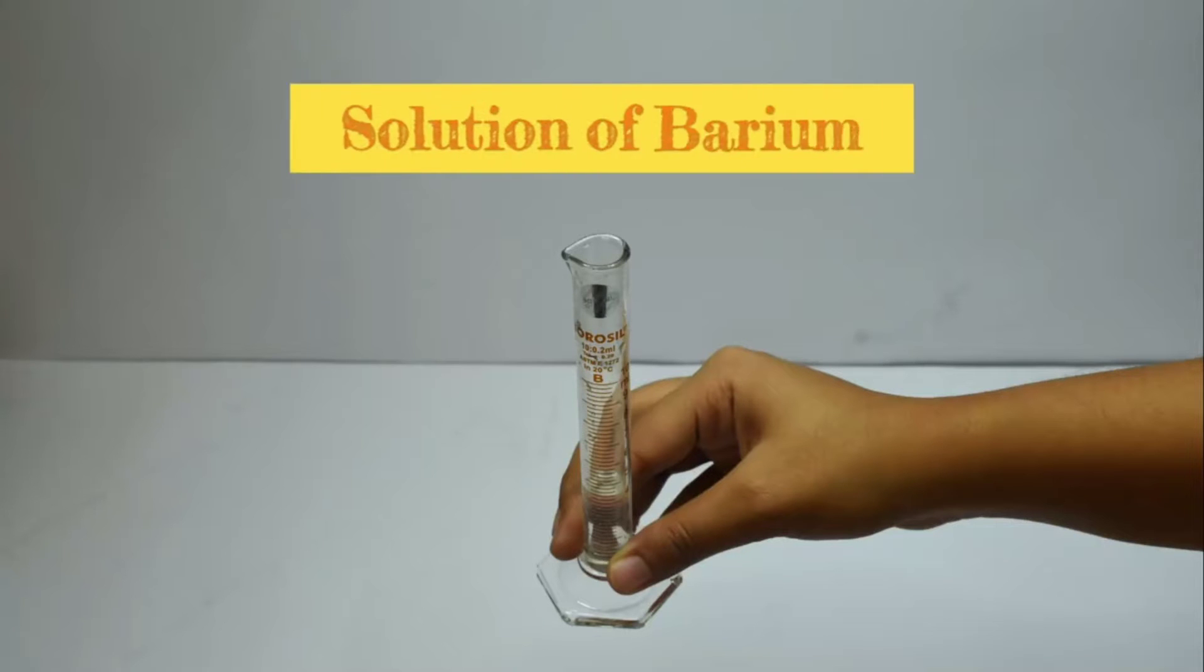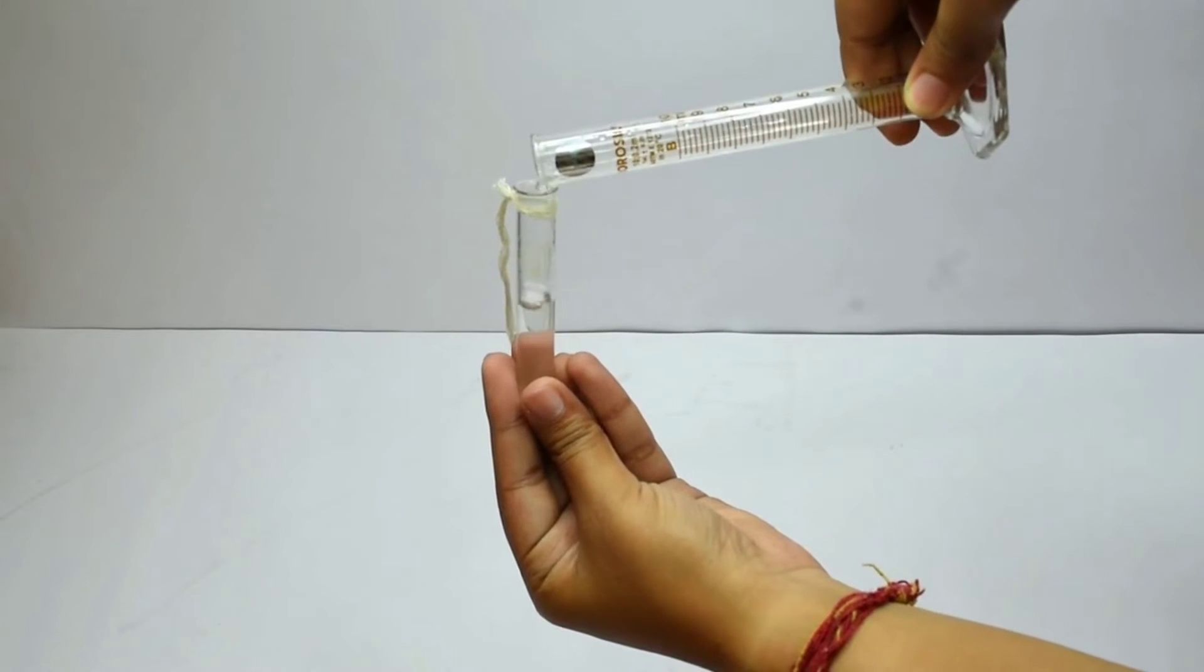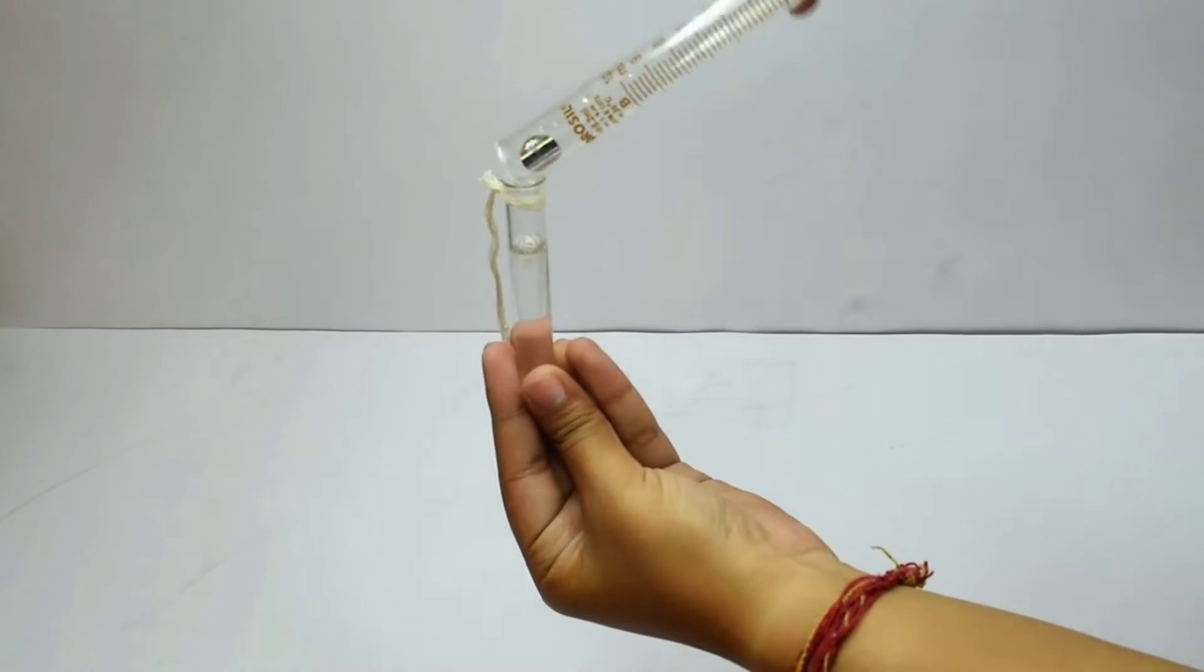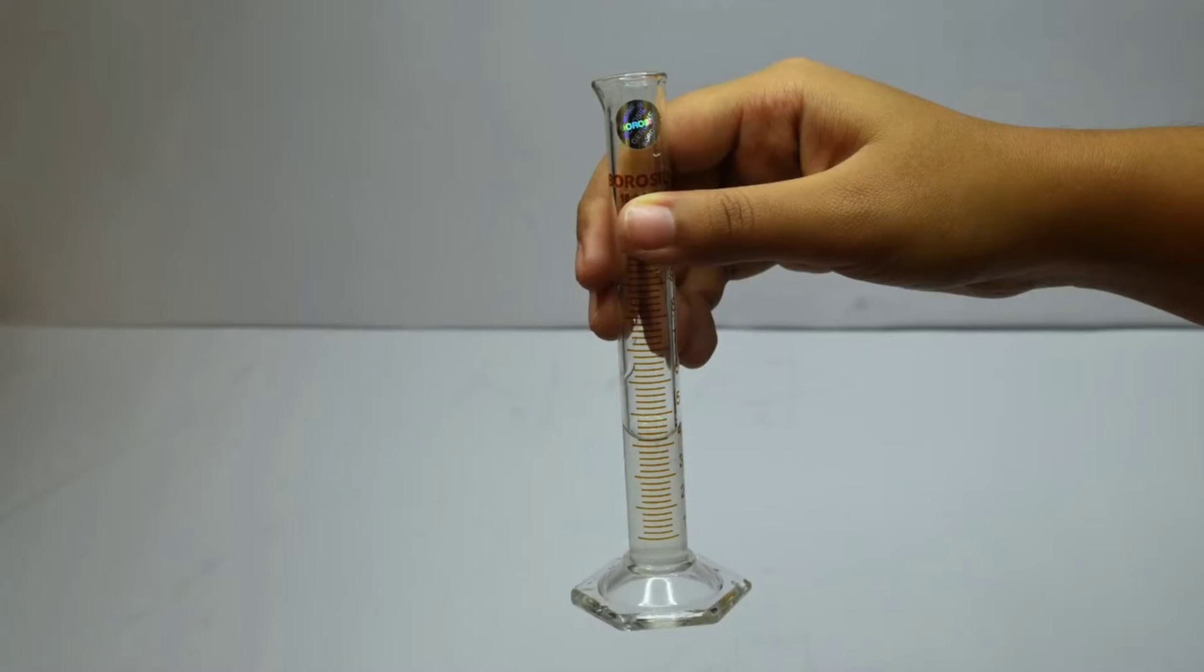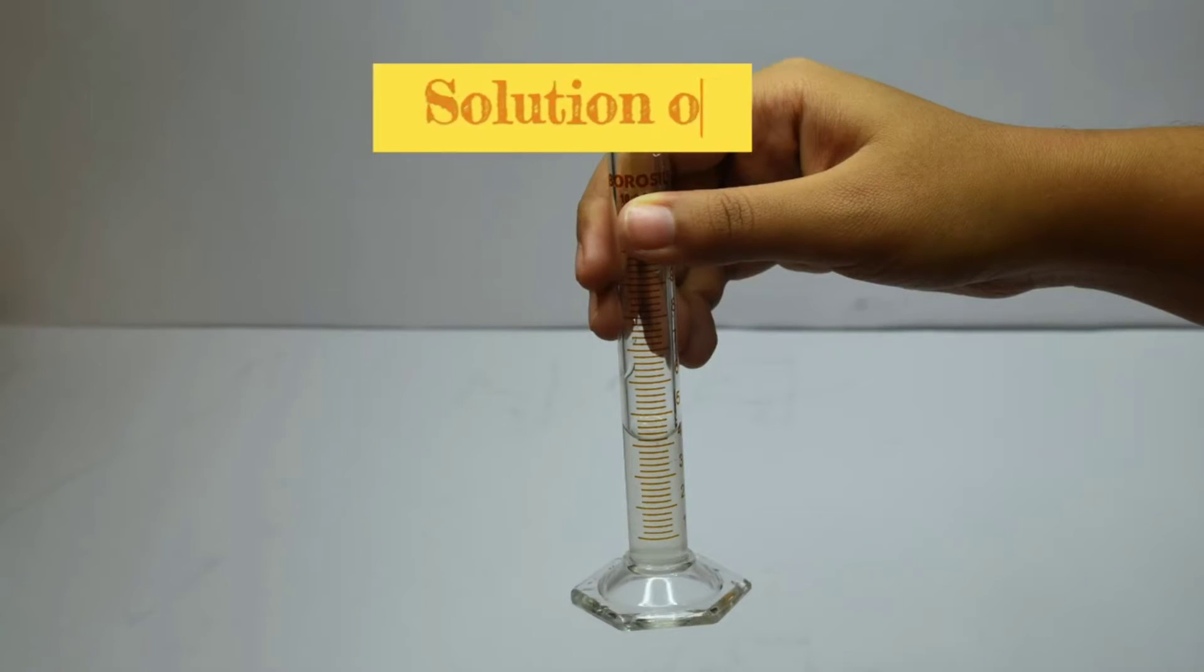First, we will make a solution of barium chloride and carefully transfer 4 milliliters of this solution into the ignition tube. Next, we will make a solution of sodium sulfate and take again 4 milliliters of it in a measuring cylinder.